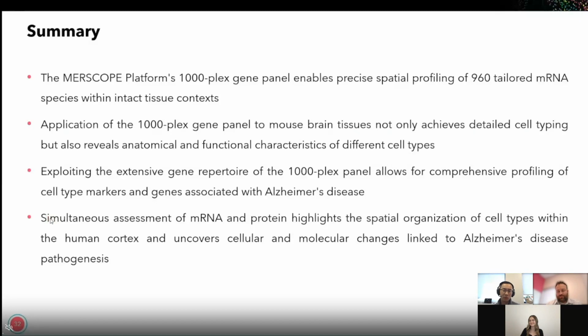Oh, so we have developed a protocol to combine the protein staining with MERFISH. Basically, we just add in the antibody staining step within the workflow of sample prep. We support different antibodies from different species, like rabbit, mouse. The primary antibody is just based on what you are interested in, and then we have a solution to detect those primary stainings. So that's already implemented in our workflow.